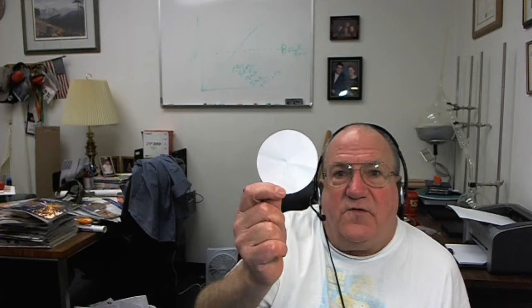This goes into a vacuum filtration system, but if you fold it into the classic funnel they taught you in chem class, you are going to break some fibers. If you use it flat, you are going to suck out the smaller fibers when you use it in a vacuum. Those are two ways you can lose mass through a filter paper — getting a filter paper that weighs less when you are through than when you started. Thank you.